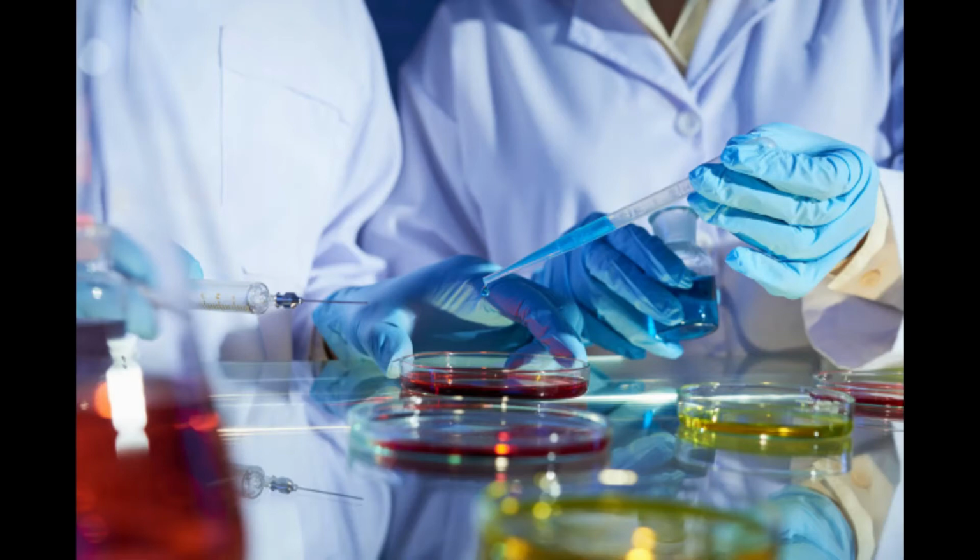So we're going to be transferring from this broth. We have a broth here of Serratia marcescens. And it smells, I know, when I open it, but it's a liquid broth, so you're going to have to take a liquid sample and transfer it to the different types of media that I have for y'all. It's all made with nutrient agar, but I have another nutrient broth, so a broth to a broth will be one of the transfers.